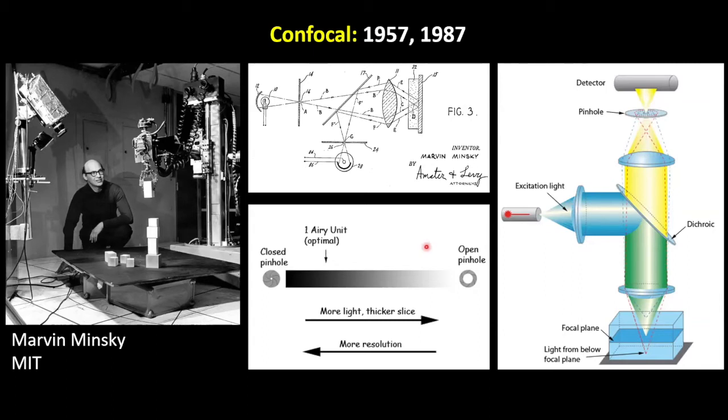On any confocal system, the pinhole is labeled in so-called Airy units. Equal to or smaller than one Airy unit is confocal; larger than one is not confocal anymore and gives you a blurrier image. If you fully open the pinhole, it's like a widefield image.